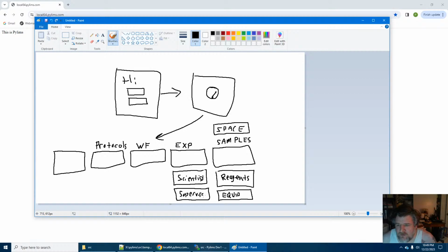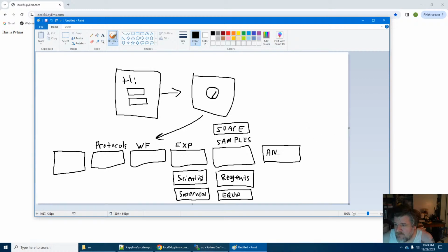The ones that get the data and stuff. This is obviously analysis of that experiment.